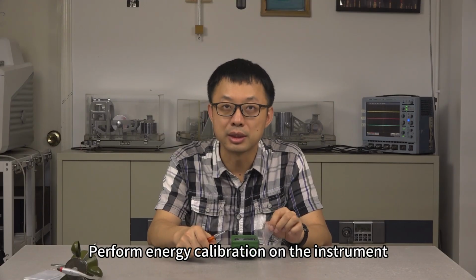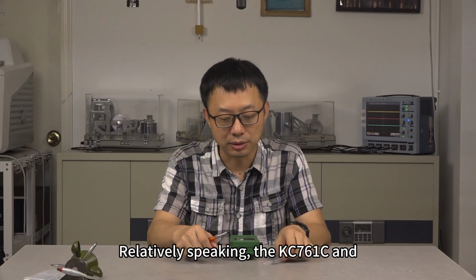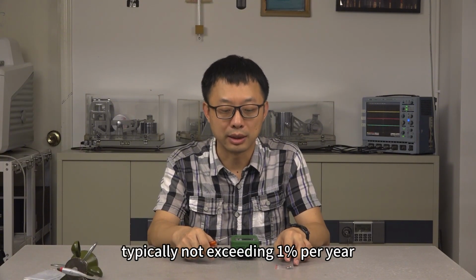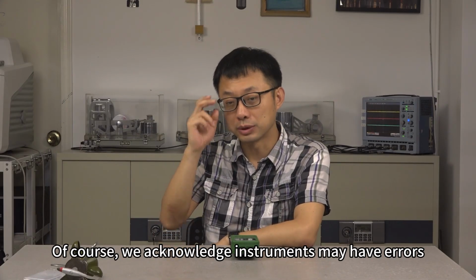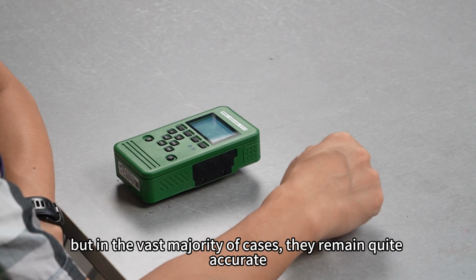Perform energy calibration on the instrument. Ensure the instrument is properly calibrated. Relatively speaking, the KC761C and 761CN exhibit very minimal drift, typically not exceeding 1% per year. Of course, we acknowledge instruments may have errors, just to give you an idea of this concept. But in the vast majority of cases, they remain quite accurate.